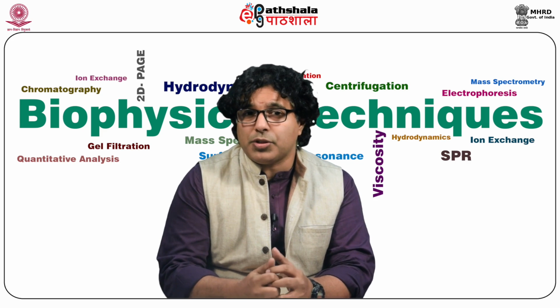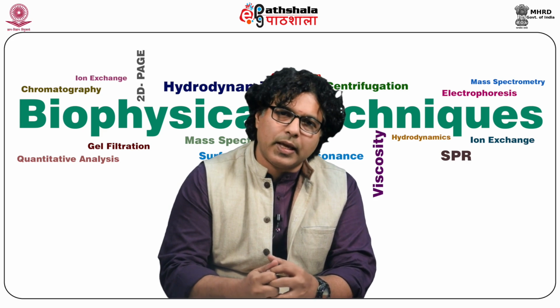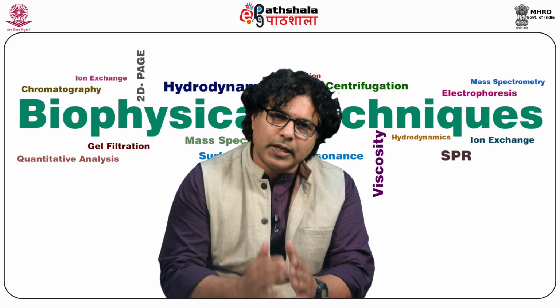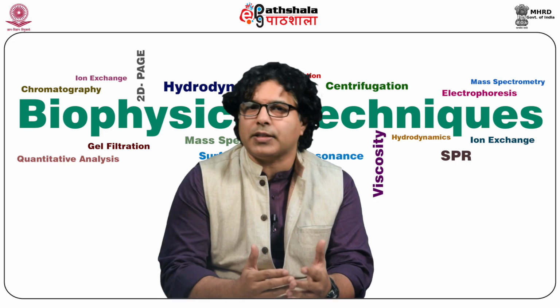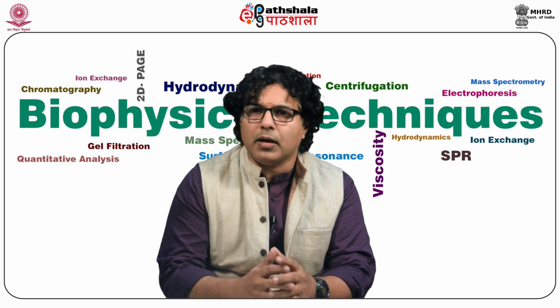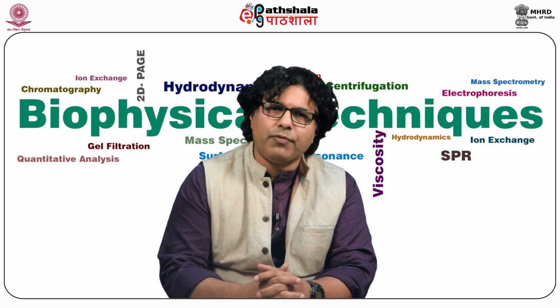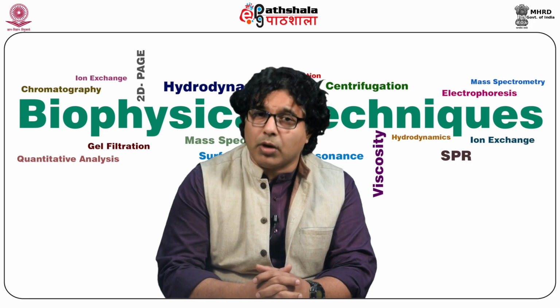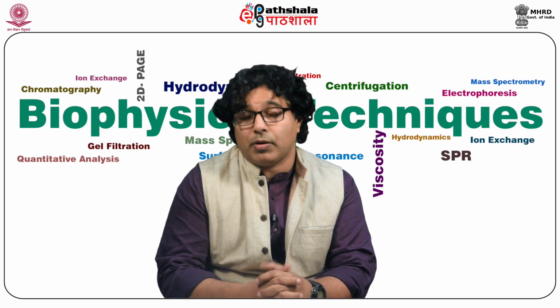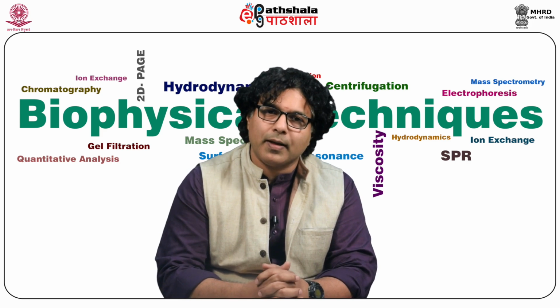This is very important because in HPLC, the type of detection method employed is entirely dependent upon the property of the analyte of interest. For example, if a molecule has a good molar extinction coefficient, you are lucky enough to get a good peak in ultraviolet spectroscopy.